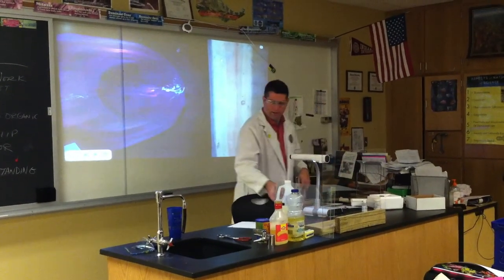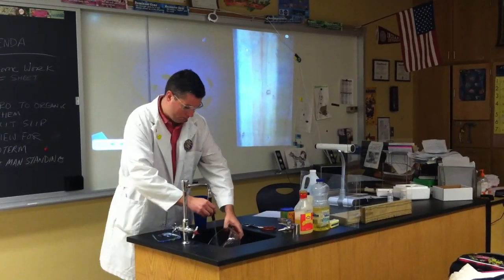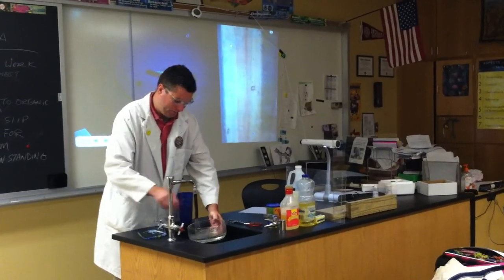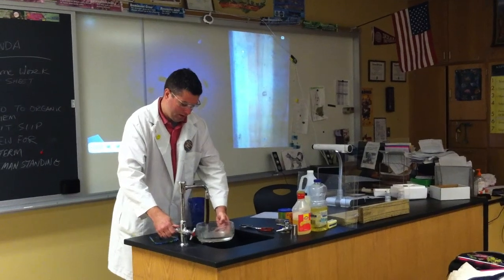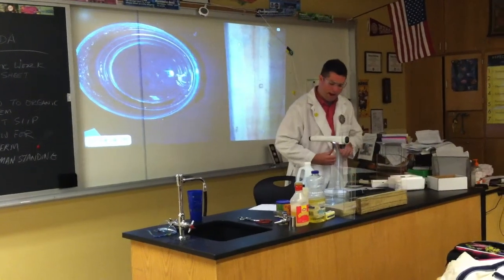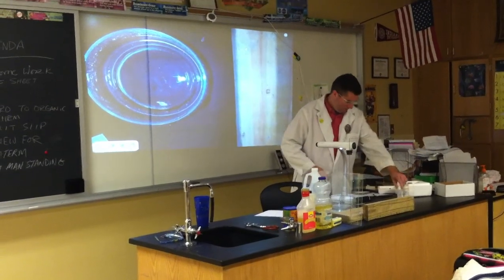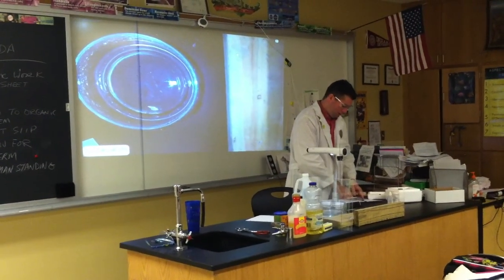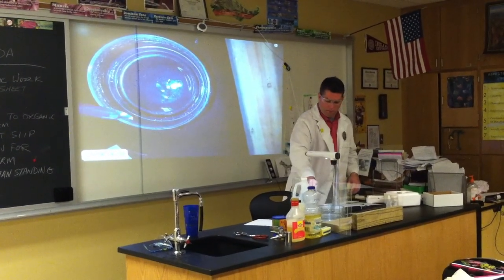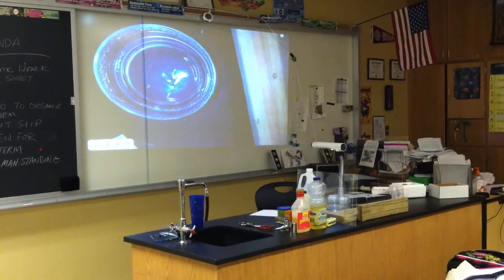All right, so I'm going to dump this down the sink and put some fresh water in there. And then we're going to try a bigger piece to see if we can get a little bit more reaction. Alright, we don't need a whole lot more. I'll put some of the indicator in so you can see it happen before your eyes. So here's a few drops. Alright, so no color change. Again, we're going to do a little bit bigger piece so you guys can hopefully see it. Alright, here we go. And I'm going to dim the other light, I think. Oops.